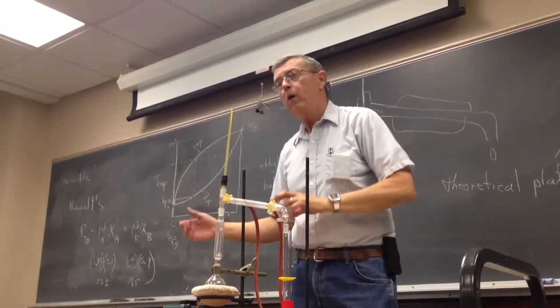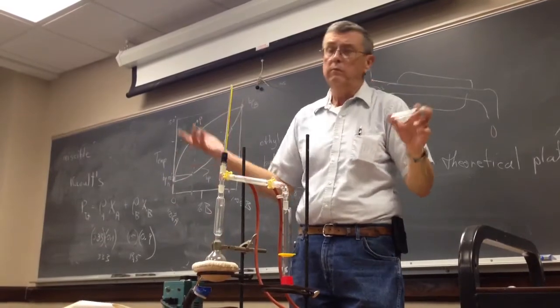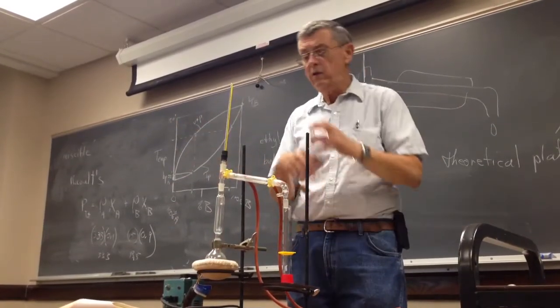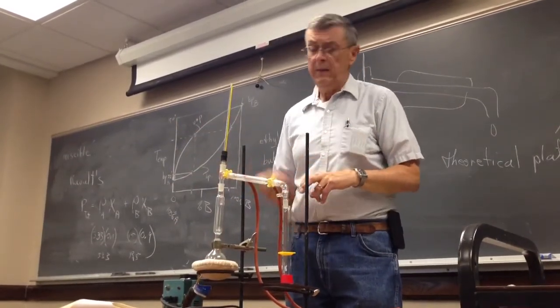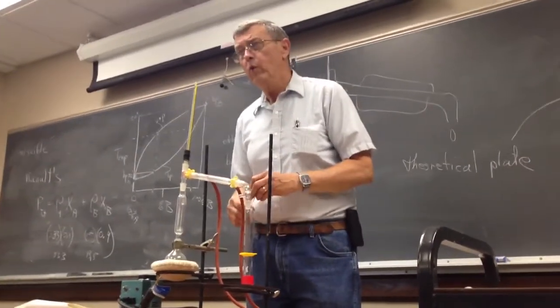I turn my power on. I turn this up to 70. Before I turn the power on, get your instructor to come over and check it just to make sure everything looks okay. Main thing is they're going to check your thermometer and that you got water running through it and whatever.